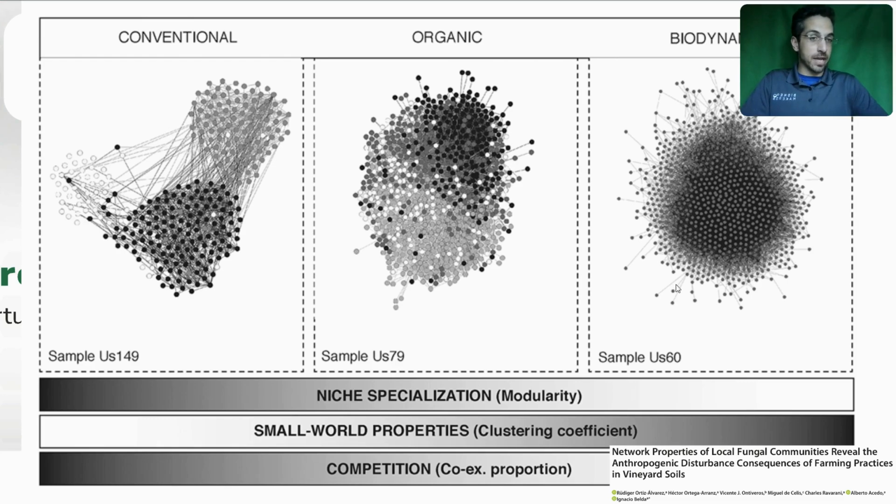Whereas on the other end of the spectrum, high scores reflect a microbiome that is integrated, that is exceptionally stable. The relationships within that community are well interconnected. It tends to be a more cooperative, more synergistic microbiome, and better reflects a natural microbial community. It is therefore a more typically durable, sustainable microbial community.